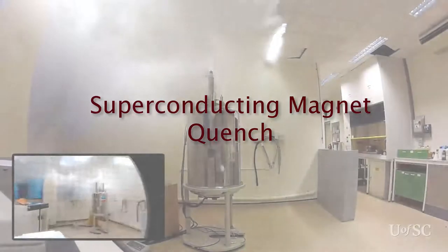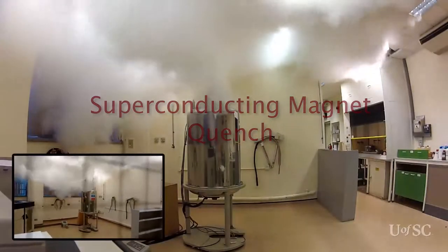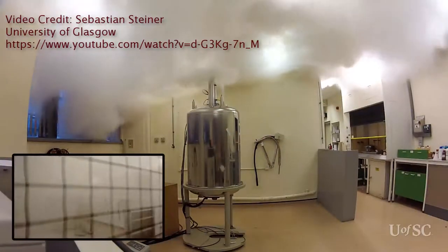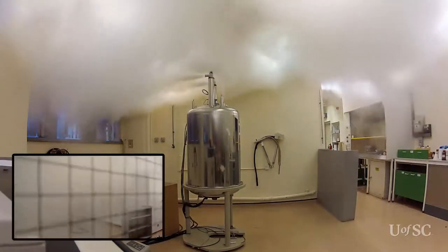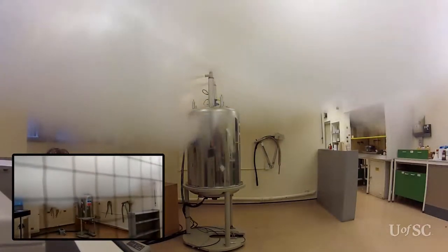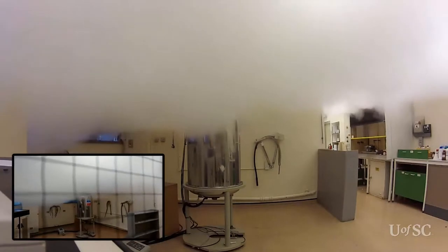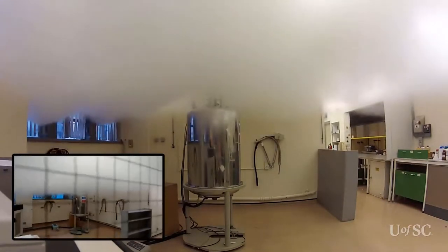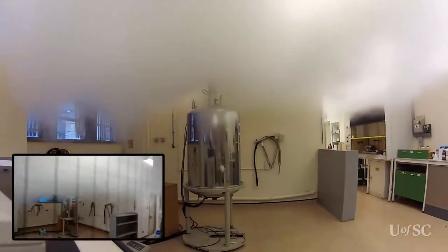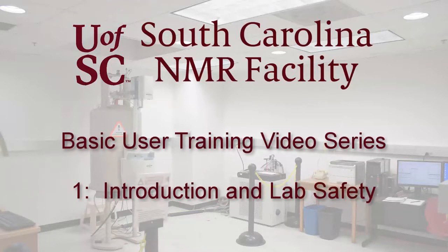NMR magnets are superconductive at very low temperatures. They use liquid helium and liquid nitrogen to stay cold and remain at field. However, rarely they instantaneously lose their field in an event called a quench. During a quench the energy stored in the magnet is released as heat into the liquid helium, causing the helium to boil off rapidly and exit the cryostat. The helium is lighter than air so it usually stays closer to the ceiling; however, it can displace all the oxygen in a room. So if you should see a rapid release of gas from the magnet like in this video, you should exit the lab immediately and contact the NMR staff. Remember the NMR facility is a lab — be aware of your surroundings, respect the magnets and their fringing fields, and read and follow any posted signs in the room.